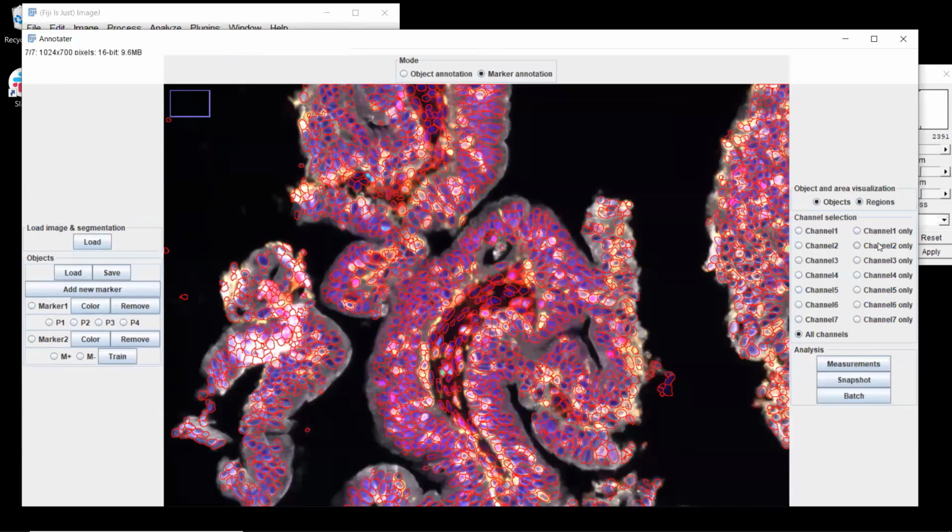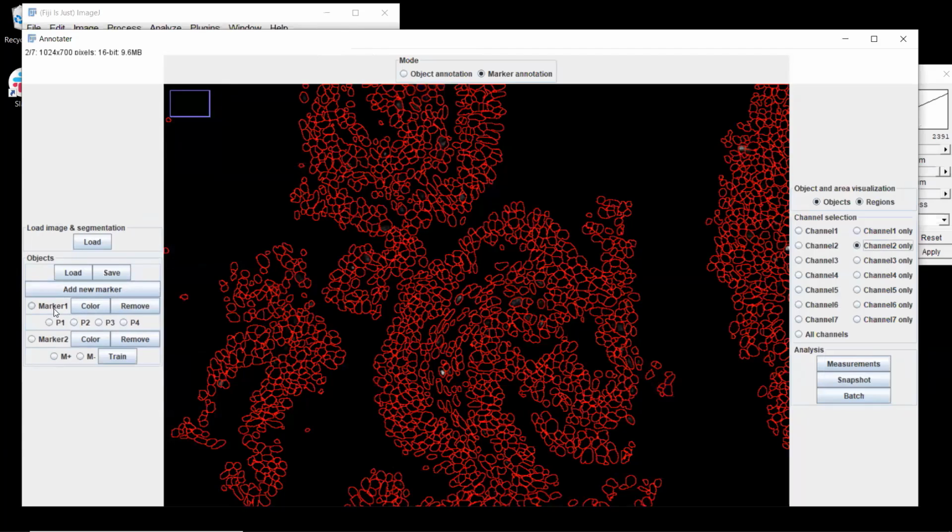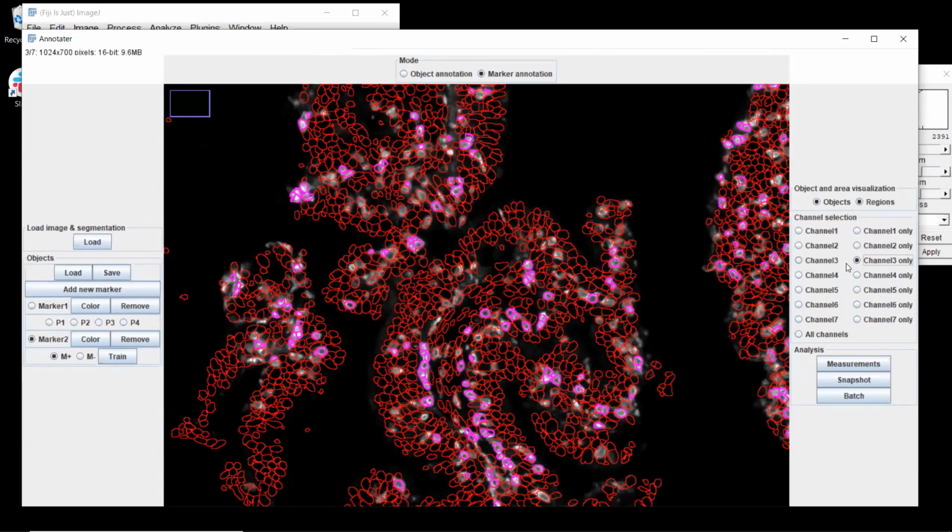And if you look at your image, the thresholding has been applied, and it seems to work fine. Maybe we missed some, so maybe we should change the threshold. If you go to your marker tool, those are the ones that are selected. And as you can see on this image, we are missing quite some, so we need to add. The classifier is still there. And now we're just going to add new labeled nuclei because I know that these should be positive, right? Okay. So you can train again, and now it looks better.